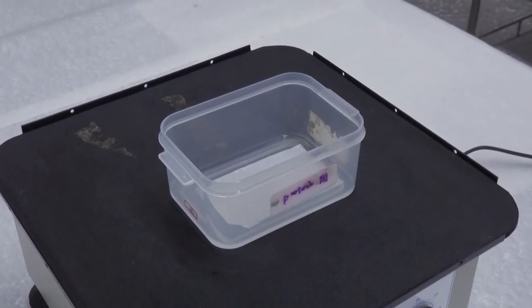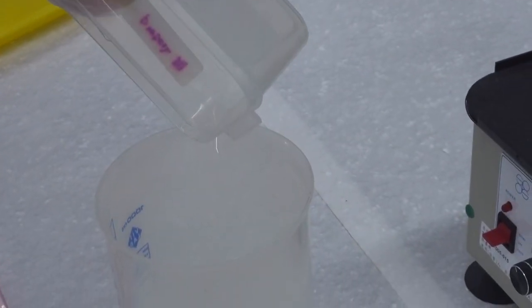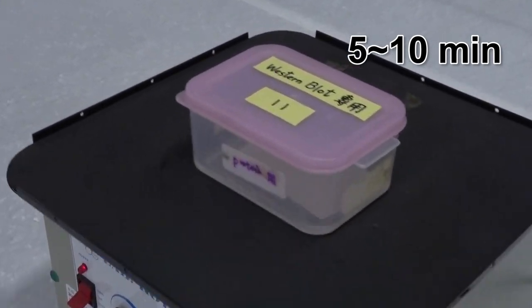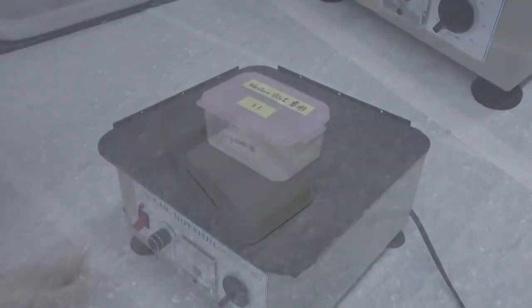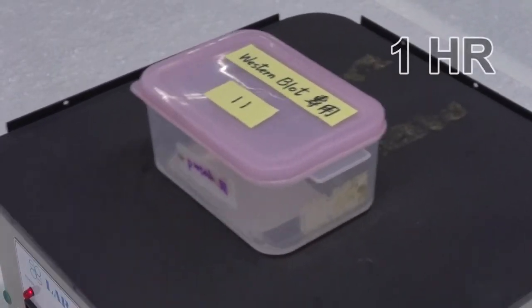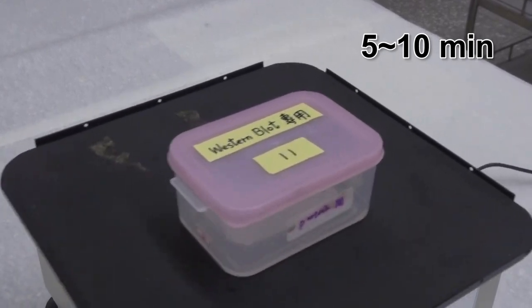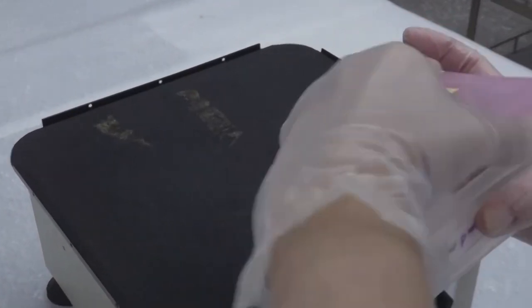Add 10 ml primary antibody solution into the box, put on the lid and incubate at room temperature with shaking for 1 hour. Remove the primary antibody solution and wash the membrane with 20 ml washing solution 3 times by shaking for 5 to 10 minutes each time. The purpose of washing is to reduce the non-specific binding of the primary antibody; decant the first round of washing solution as soon as possible. Add 10 ml secondary antibody solution into the box, put on the lid and incubate at room temperature with shaking for 1 hour. Remove the secondary antibody solution and wash the membrane with 20 ml washing solution twice by shaking for 5 to 10 minutes each time. The purpose of washing is to reduce the non-specific binding of the secondary antibody; decant the first round of washing solution as soon as possible.